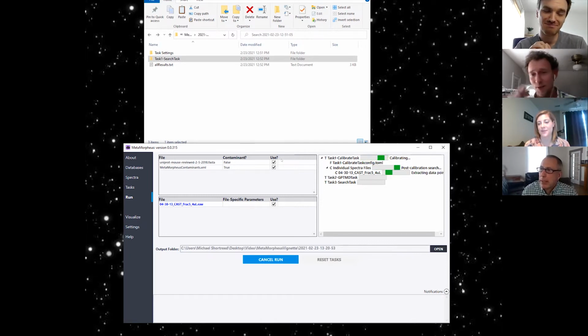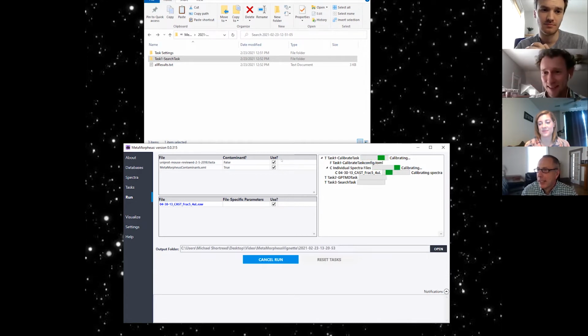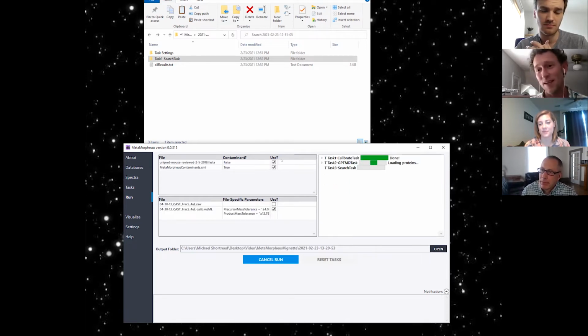So not hypothetically, because we do these multi-lab studies, right now we just collected all this data, and I do have 35 instruments. And for us, do you take what a user reports? What they think is good? Another valuable thing here is, let's say you're 2 weeks out from your calibration for whatever reason, and your thresholds are getting a little wonky.